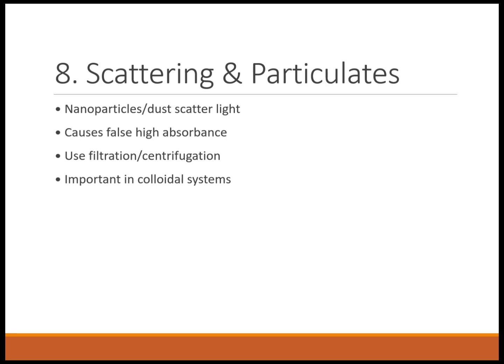They can cause false absorbance, and so filtration can remove the dust particles from the sample, and the sample will then give accurate results. Centrifugation is also important so that aggregated nanoparticles can be separated and the cleared sample can be analyzed, which can give better results.